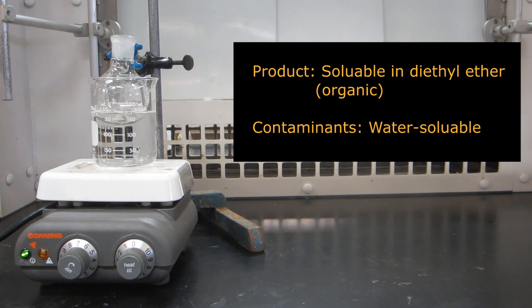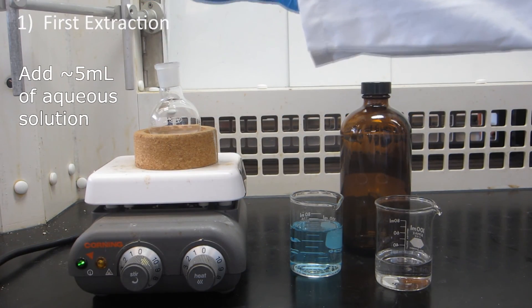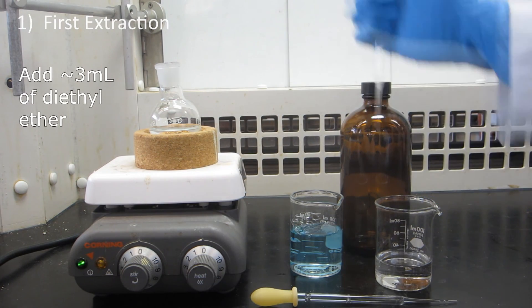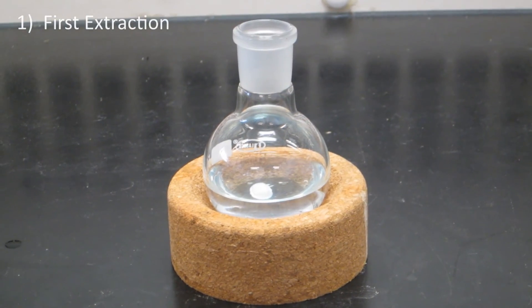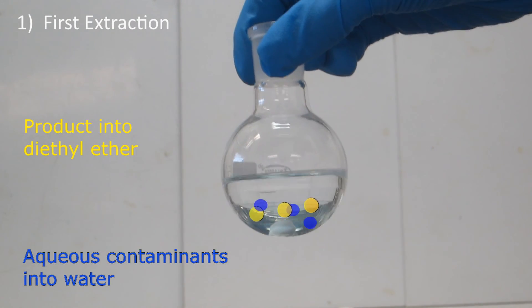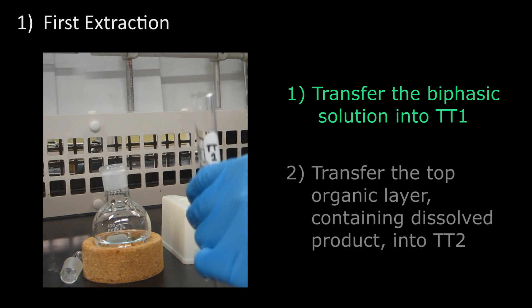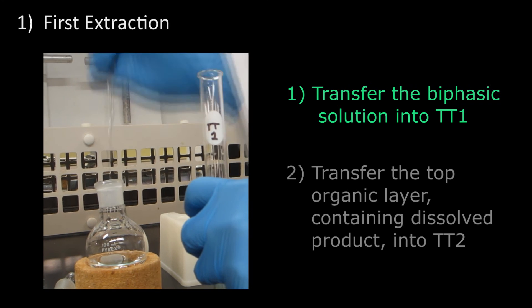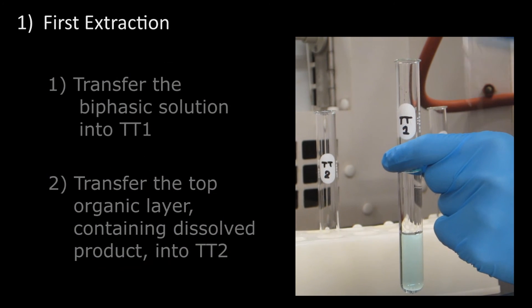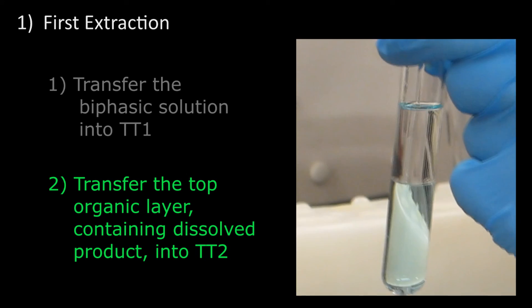Microscale technique: Suppose we've created a product that is soluble in diethyl ether but it contains water-soluble contaminants. First, we would add about 5 ml of distilled water or other aqueous solution, and add about 3 ml of diethyl ether to the reaction flask, stir, and then allow the solution to sit for about 1 minute. In doing so, we have begun separating the aqueous contaminants into the water and the product into the diethyl ether. Use a pipette to transfer the solution into the first clean test tube labeled TT1. Then get another clean pipette and transfer the top organic layer containing the product dissolved in diethyl ether into a second test tube, TT2.